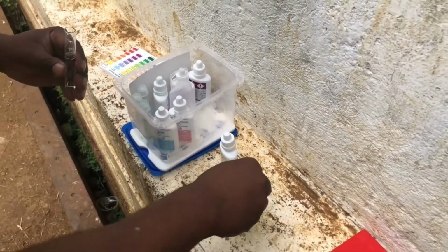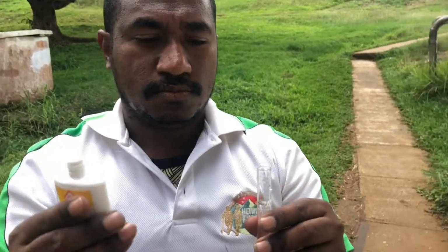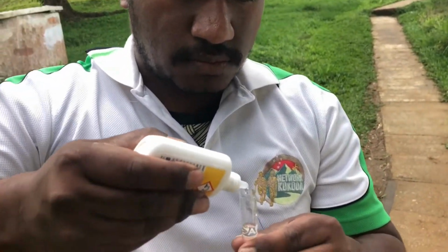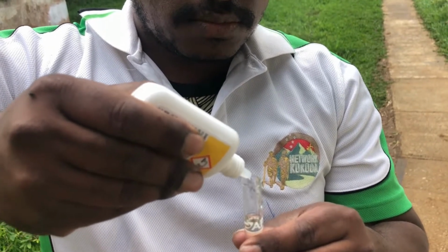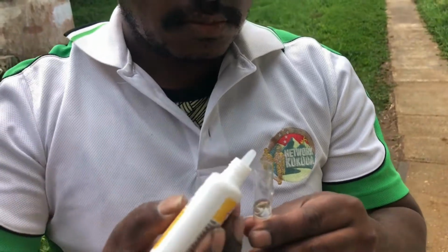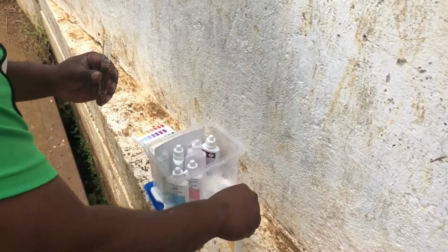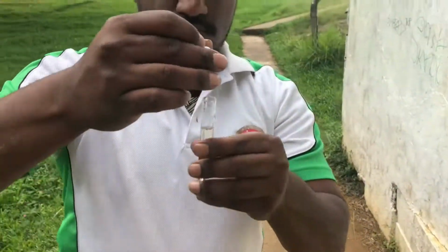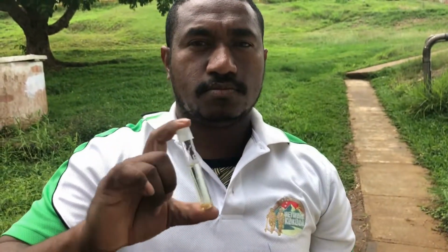Also put 8 drops of ammonia test solution 2. Then we put the cap on and we shake it fast for 5 seconds. Now we have to wait 5 minutes, so we'll put it back in the tub.